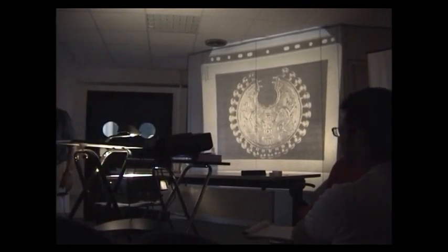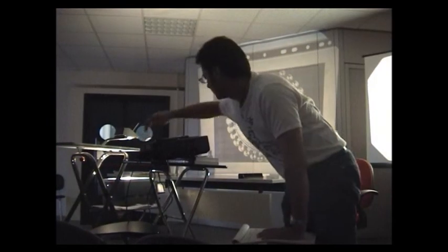I think I have a good representation in the second slide. You will see. The first one will show you probably that it was possible to analyze also some potteries, and you see the beam line of protons. The protons are not illuminating the material.